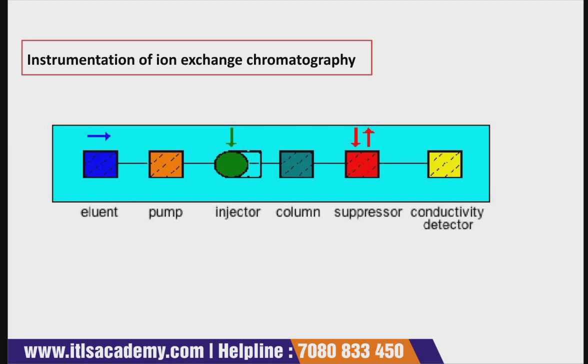Now comes the detector. An electrical conductivity detector is commonly used. And what is the data system? Basically a data system is needed, and in this the information is displayed on the screen that is connected to the computer.